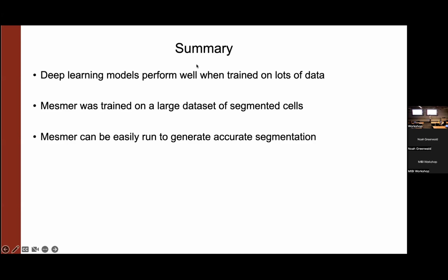It's just the case that many of the data sets we trained on did not have those. And so there's sort of a bias in the training data, and that means there's going to be a bias in the results. It's much more likely to say, I'm just going to capture the center part of the cell rather than the whole thing.